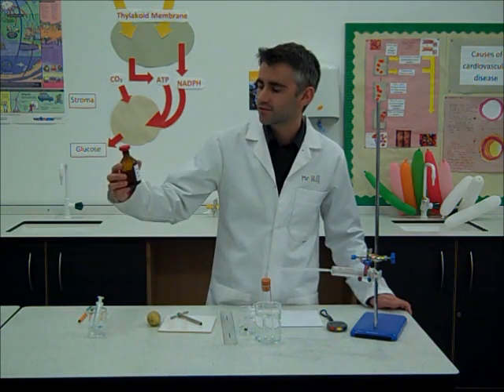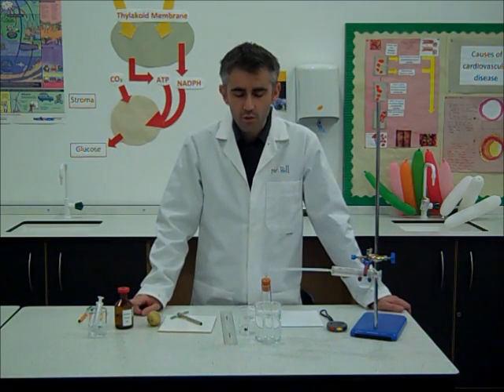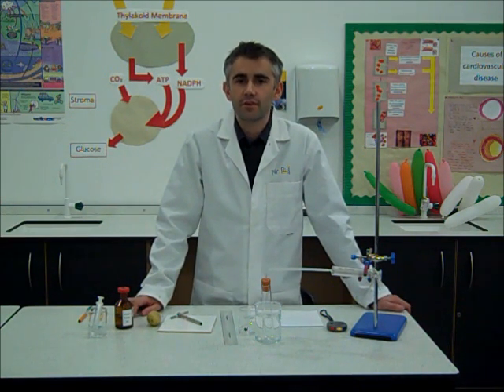I'm going to use 10 millilitres of 20% hydrogen peroxide, a pH buffer of 7 and the water bath will remain at room temperature throughout the experiment.